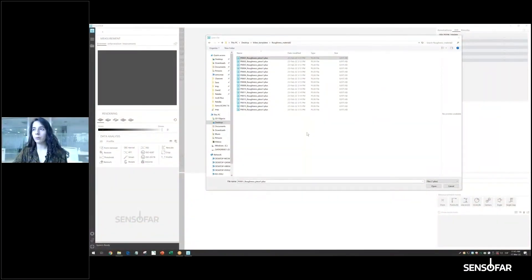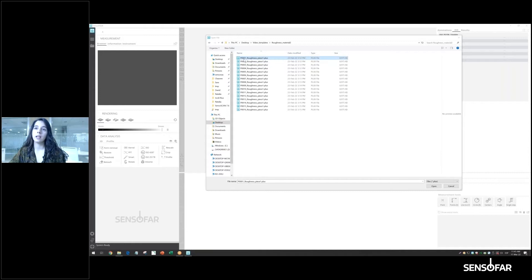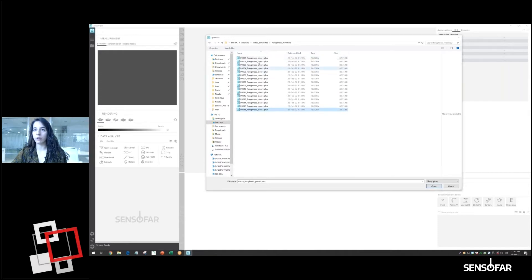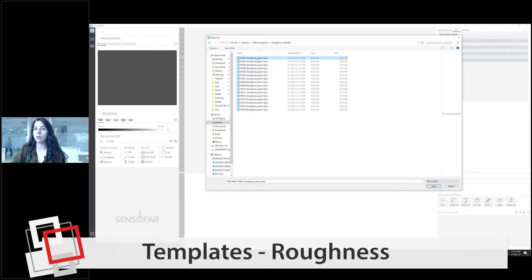We're going to review two specific cases for these templates. The first one is going to be roughness analysis and the second one is going to be critical dimensions. Here we have a folder with a lot of different topographies in which we want to calculate roughness.